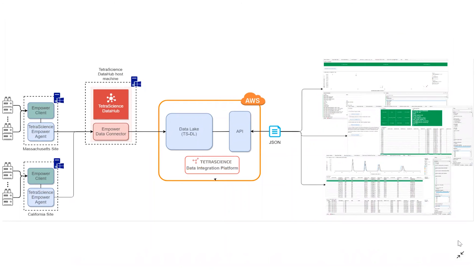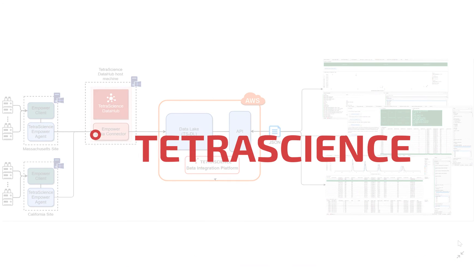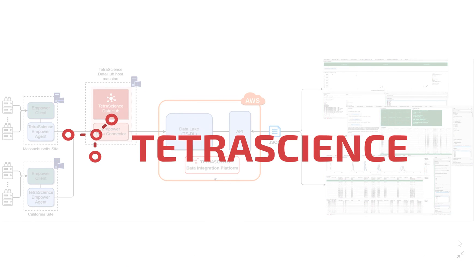This data is accessible to downstream consumers, like a visualization tool, where scientists or business users have access to data across disparate data sources. With the power of an extensive integration list and scalable data platform, cutting-edge labs are getting more from their Empower data using TetraScience.